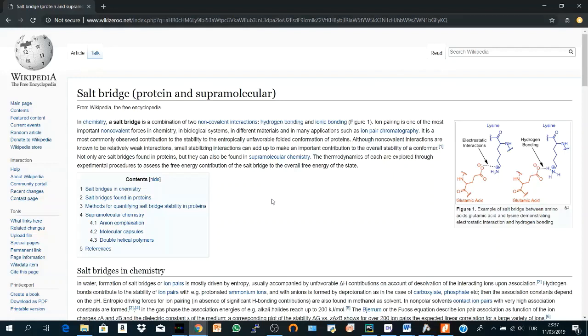Actually the salt bridge is one of the most important interactions in proteins that contributes dramatically to the protein stability because it combines two important features or interactions.